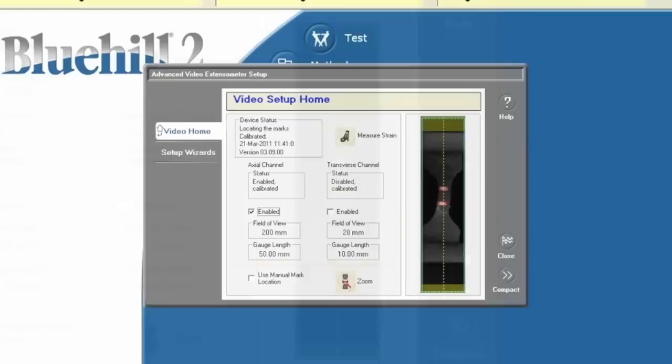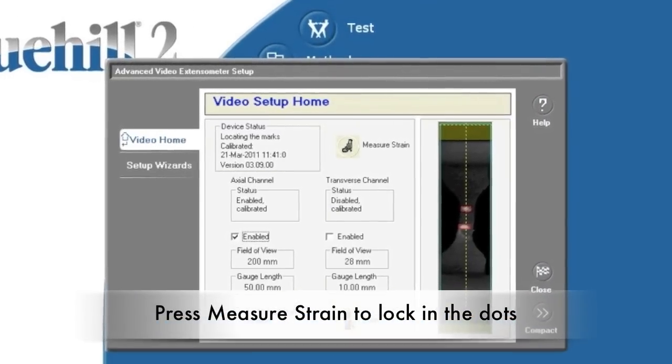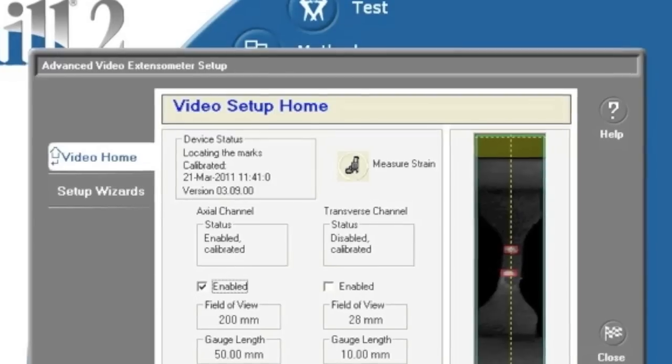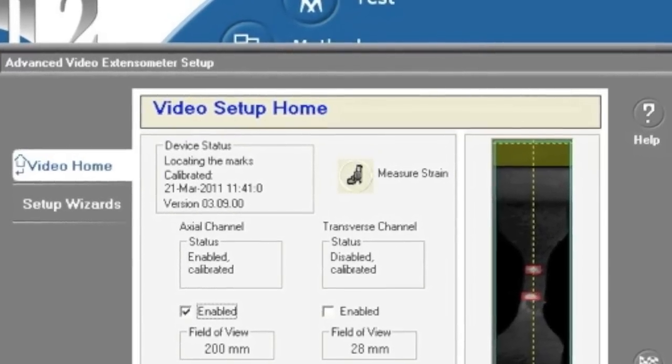Once the red boxes appear, press the measure strain button. The distance between the dots or the gauge length will be displayed on the screen. This will lock the dots into the software so the gauge length will be monitored throughout the experiment.